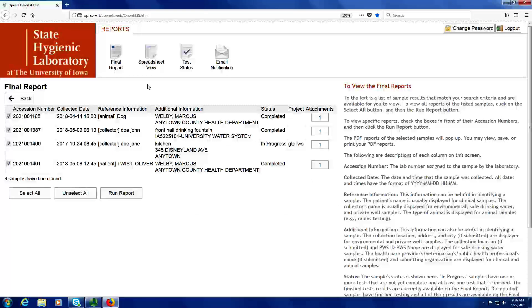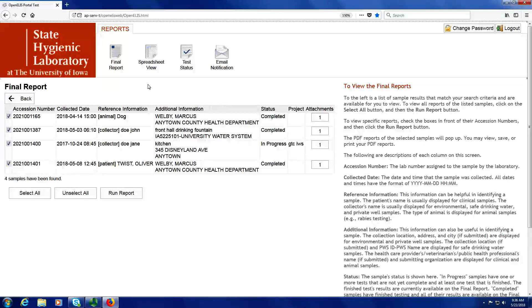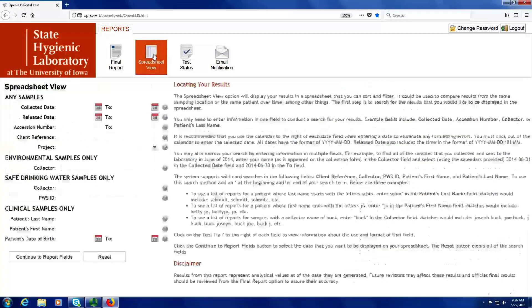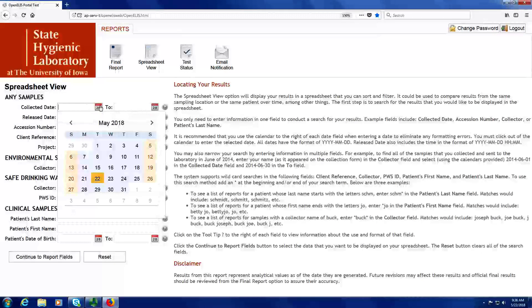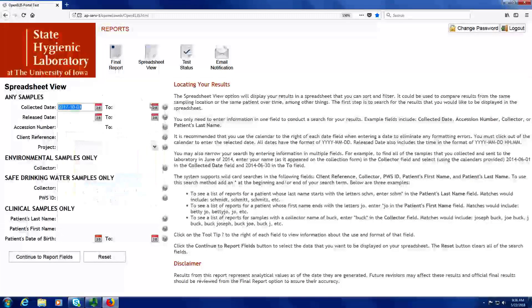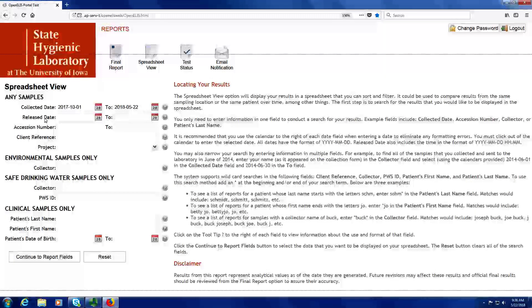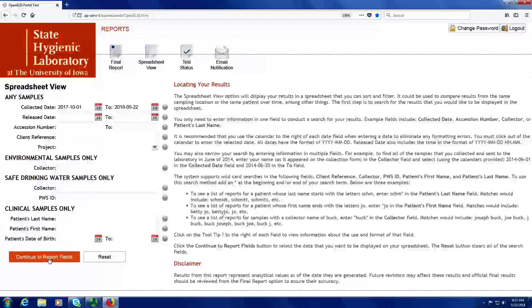Through the OpenELIS web portal, you also have the capability to download your results into a spreadsheet. Many people prefer a spreadsheet version of the results because it is often easier to compare results over time or run test counts for your organization. I click on the spreadsheet view button, and then I am going to search by the same collected date range as I used for the final reports. I can also search by any of the fields that are present on the final report screen. Next, click on the Continue to Report Fields button at the bottom.